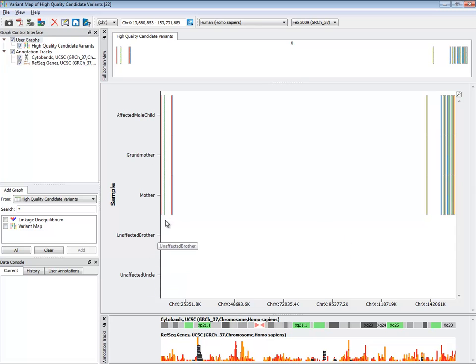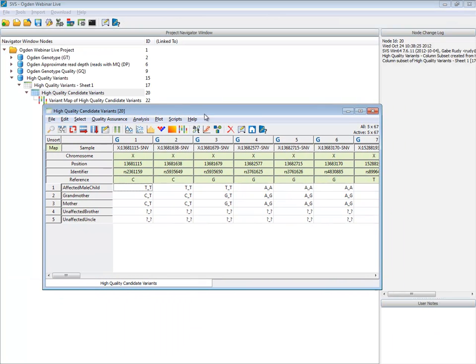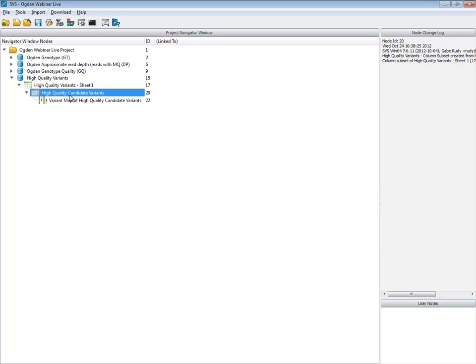So this actually shows us what regions are essentially inherited and at risk to the male, and this was something that in the paper Gholson also orthogonally found: there were 2 regions through haplotype analysis that were inherited in a way that could contain the disease variant. So there we have our high quality candidate variants.